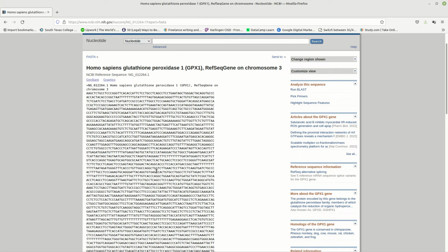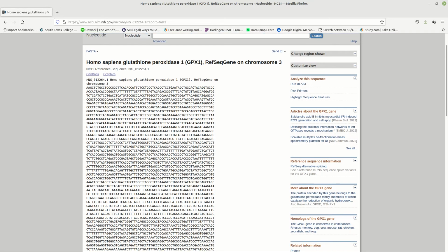If you want to understand the issues with that, I put out a video recently that explains what to do. Just find the complement for the sequences you're looking for, and that'll find the equivalent in DNA. So if you're looking for a TATA, instead of looking for TATA, you would look for ATAT. That's the only difference when searching for sequences.